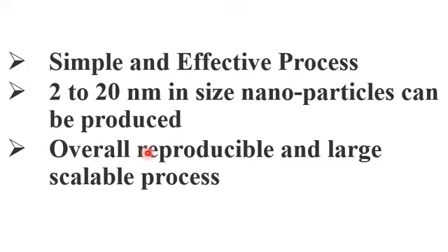And secondly, you can prepare a fine nanoparticle at very large scales, even in kgs. So you can produce a lot of material at the same time, and that material is reproducible. This is a very important advantage of the ball milling process, especially for industries.